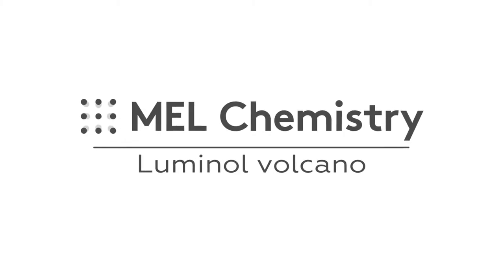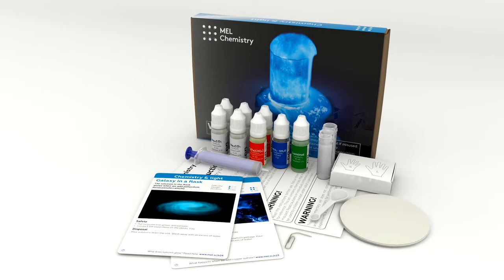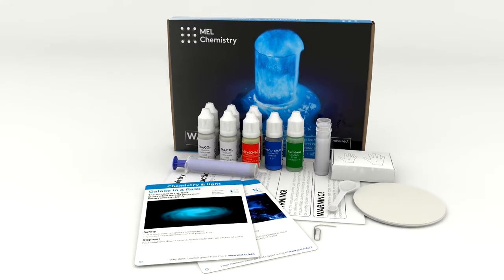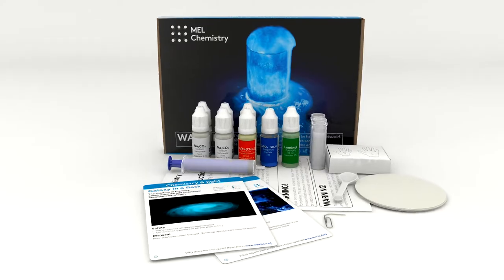Welcome to the wonderful world of chemistry. Today, with the help of the Chemistry in Light set by Mel Chemistry, we will learn how copper sulfate crystals can make a luminol volcano erupt.